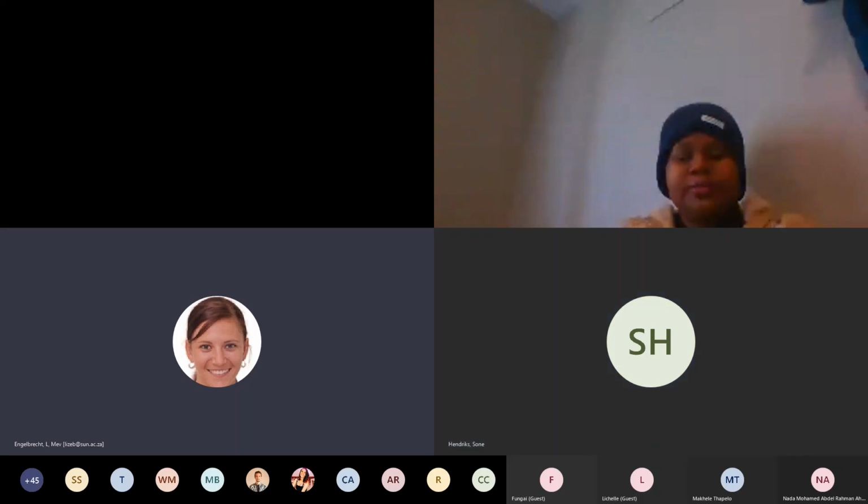There is a question from Saeed, who says, if I'm working on rocks for maceral composition, what type of fluorescence microscope would I need? I'm not sure if that is something you can answer now, or should we leave it for the end? Let's leave that for the end. Saeed, I would actually like to find out quite a lot more. First of all, the first question that I would ask you is, are these rocks autofluorescent? And then you can use any fluorescent microscope. It depends on really what you want to see on these rocks. So it becomes a whole discussion of what your sample is, what type of fluorescence you expect to see, and what information you want to get out of it.